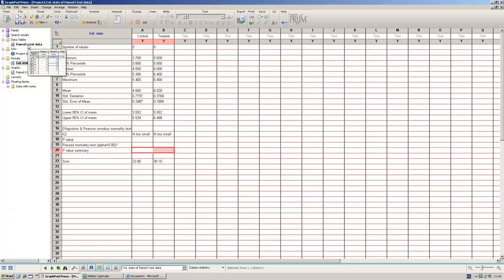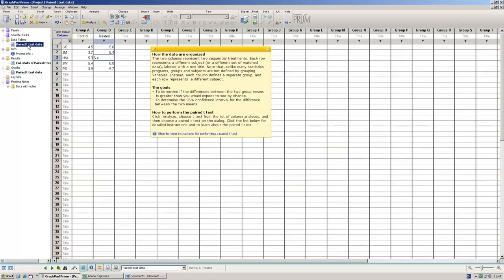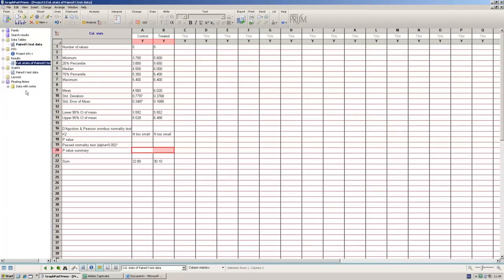As I mentioned, this additional column on the left here, we can switch between the different sheets basically. So we've got your raw data here, you've got your results sheet here, and you've got your graphs, which we're going to look at in a second.